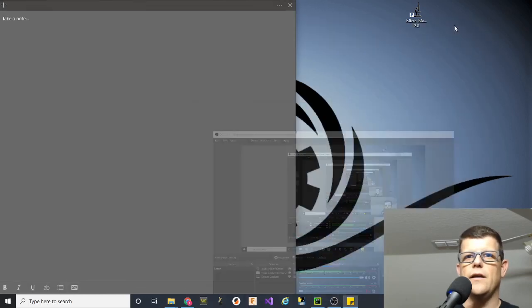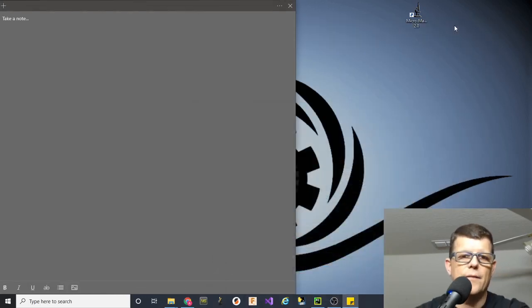All right, this is a quick video to show how to set up the Triggerscope 4 in MicroManager Gamma 2 using MicroManager firmware. You probably already have MicroManager 2 Gamma, but if not, you want to pull that down from the MicroManager Nightly Build website. That's the best place to get it. And you want to get the 64-bit version.